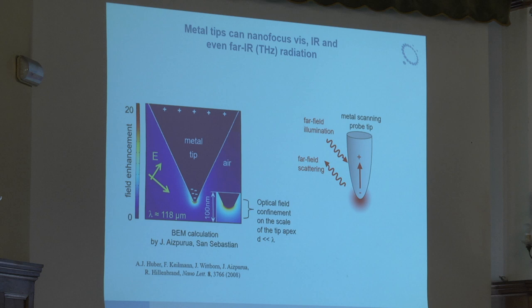That means 400 times field intensity enhancement, which is quite a lot. So in this schematic, we can depict that this polarization gives us a dipole, here, this red arrow. And now light comes in, it induces the dipole. We create this near field here, schematically drawn.